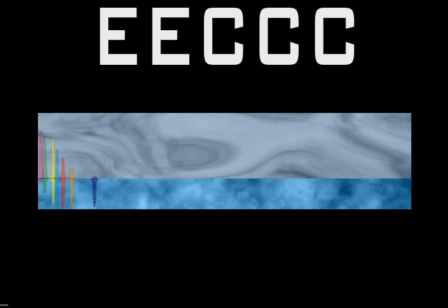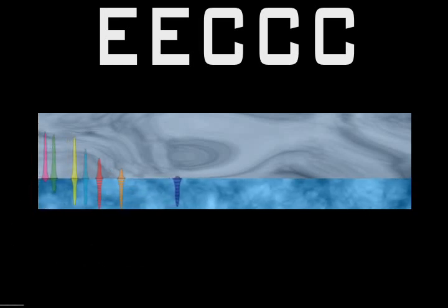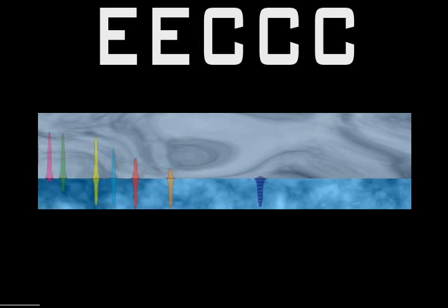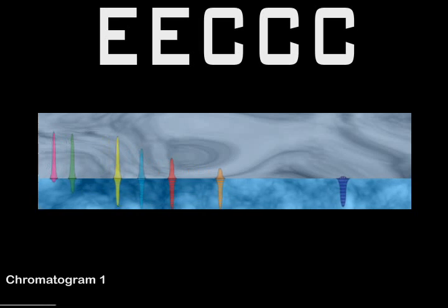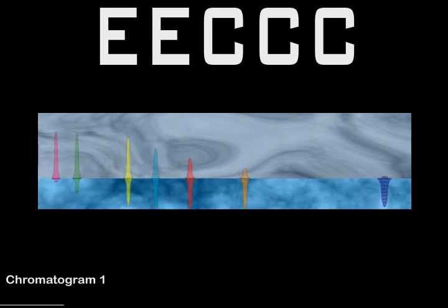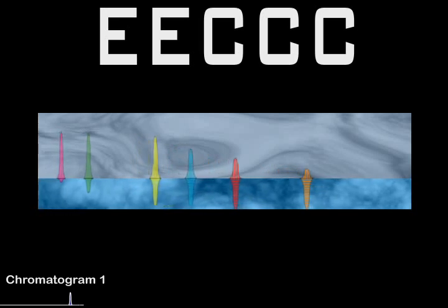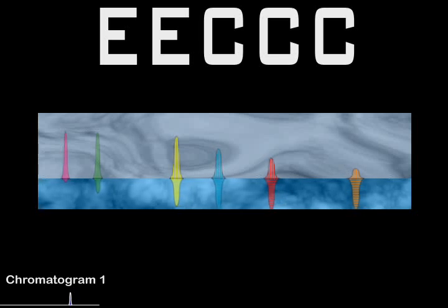Separation starts almost immediately after injection. The affinity of each compound for the mobile or stationary phase is indicated visually. The dark blue compound has a high affinity for the mobile phase, hence it is traveling at nearly the same speed and is the first to elute from the column. This is a demonstration of normal elution. The slower moving compounds are those that have a high affinity for the stationary phase.